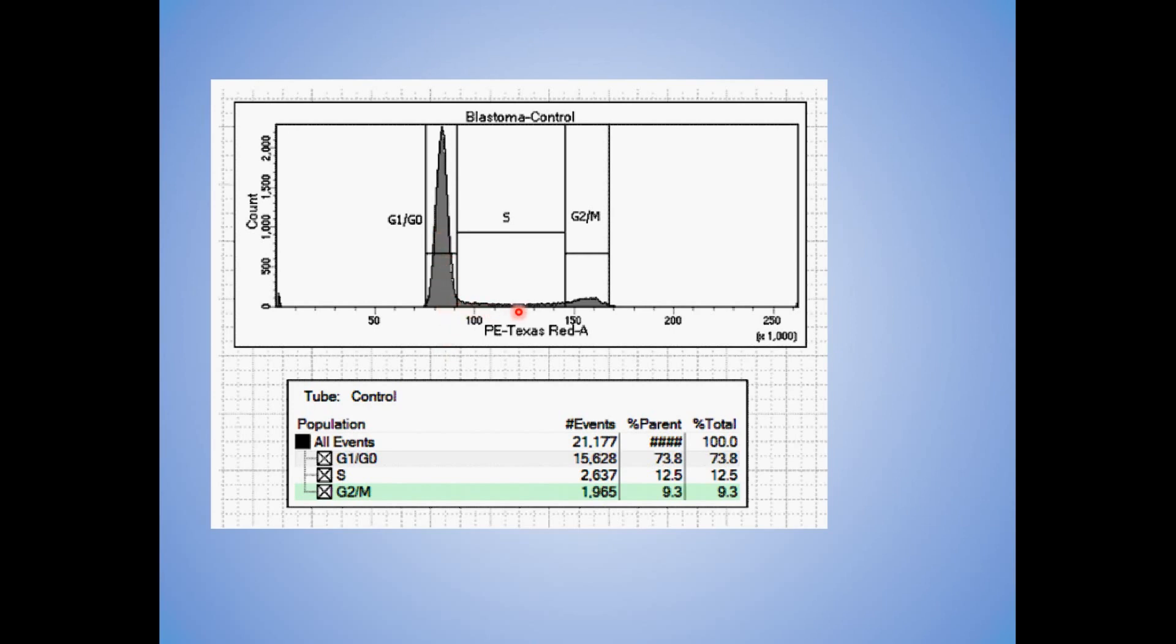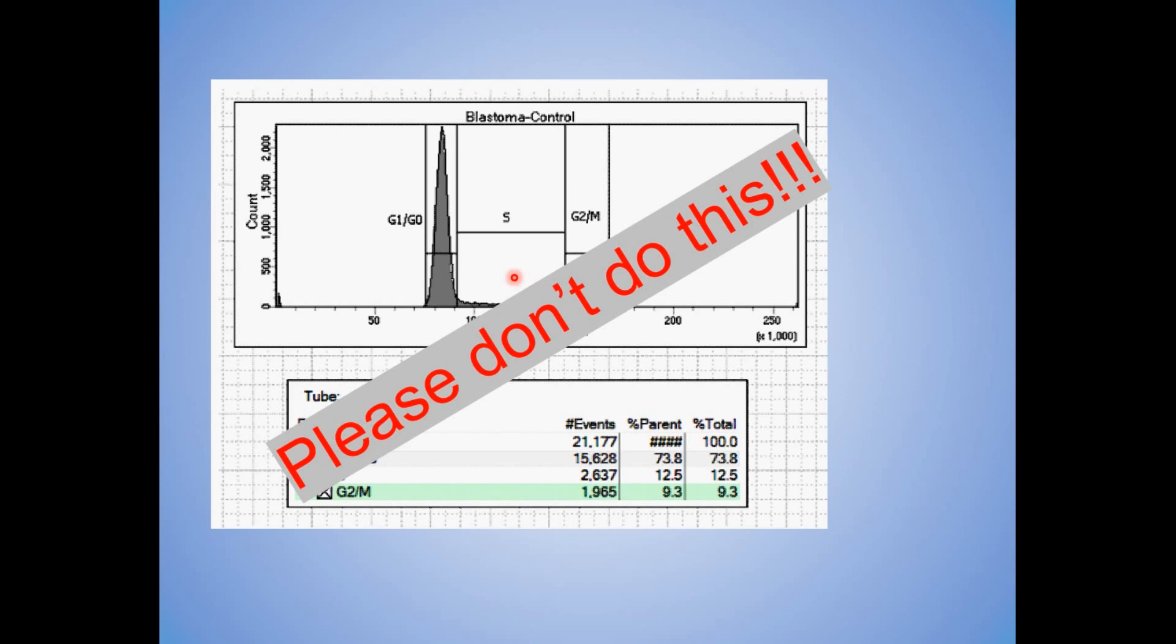And this is where you would take that cell cycle data, as shown here, and you would put regions for G1, G0, S, and G2M. The simple upshot is your core staff would prefer you simply didn't do this. We're going to talk about a couple of reasons why not shortly.